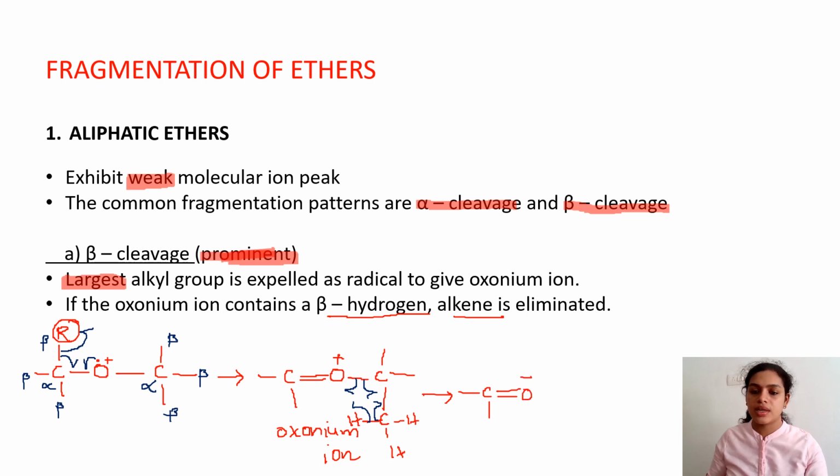Double bond O plus, again no change. Instead of this carbon bond, here 1 hydrogen has come. That's one change. And what are the remaining ones? There are 2 bonds over there, single bond, 2 hydrogens. That also can be any other groups. Since it is hydrogen here, I'll write it as hydrogen itself. And now see, there is a double bond formed, a newly formed double bond. This is how the alkenes are eliminated, and again the C double bond O plus H ion is formed.